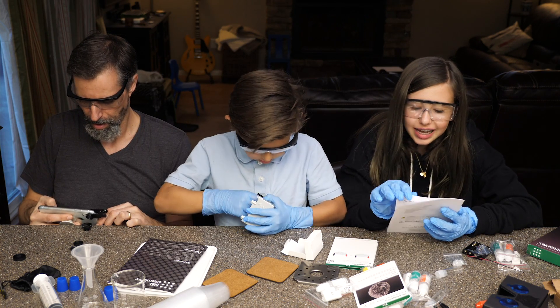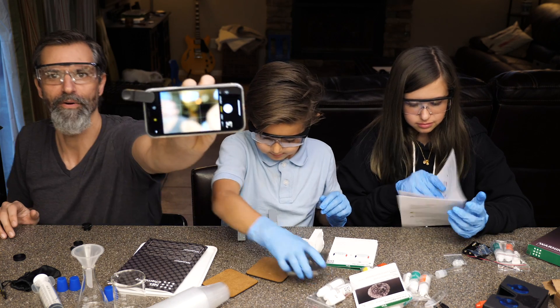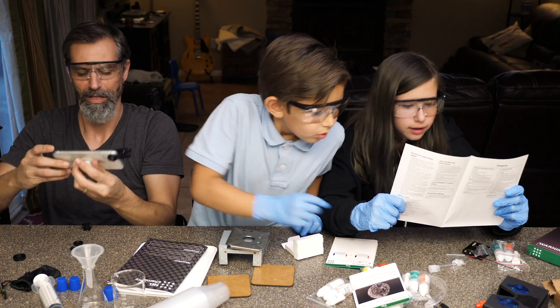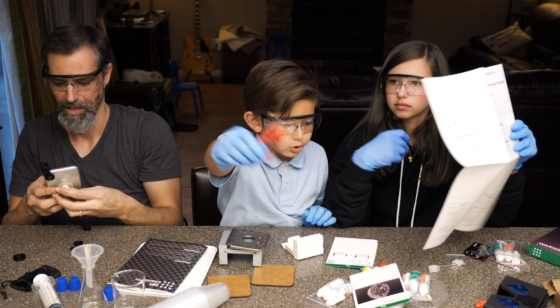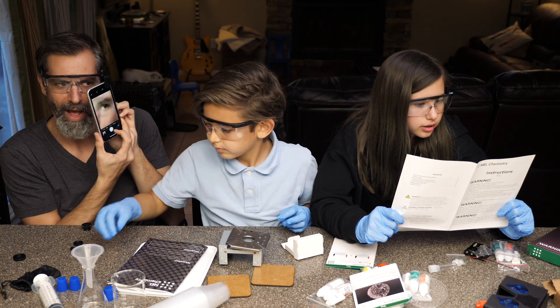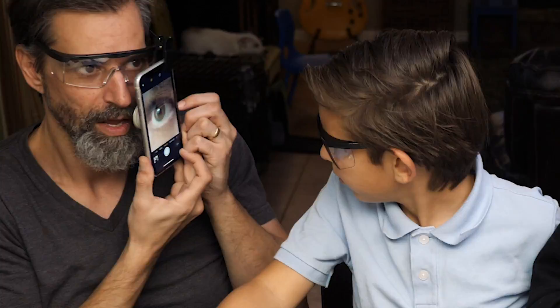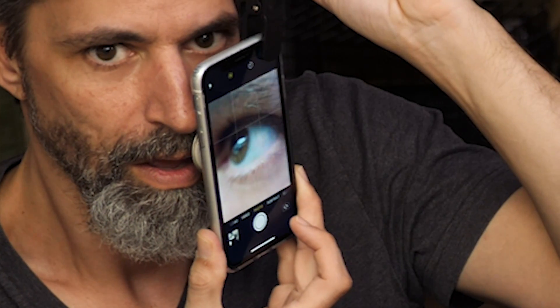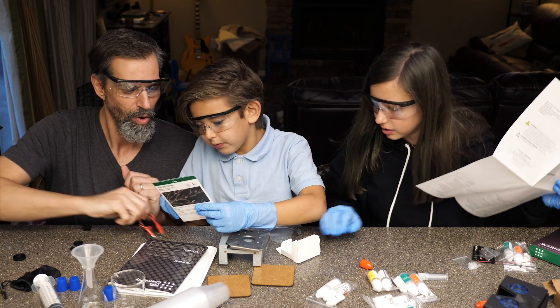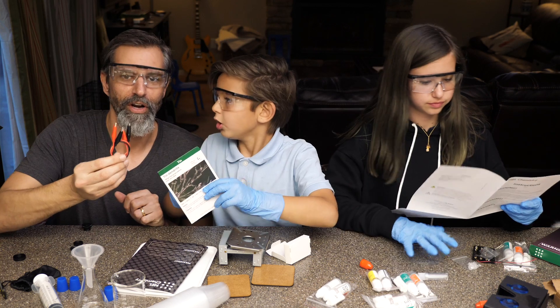Not suitable for children under 10 years. Oh, Jonna, you're not 10. Look at this cool photo I was just able to take. We get to mess with like hydraulics and stuff. This is zoomed onto my eye — prepare to see my eye close. Whoa, closer. So you get to watch your crystal grow. With electricity? Yeah.